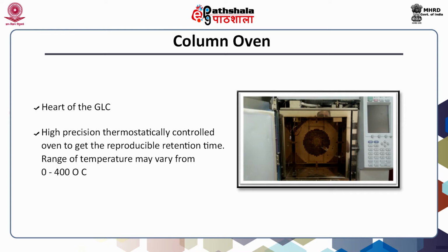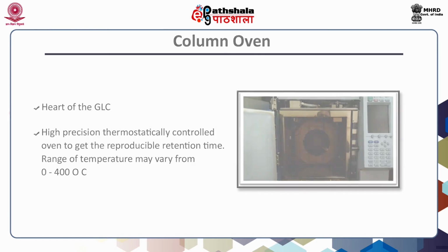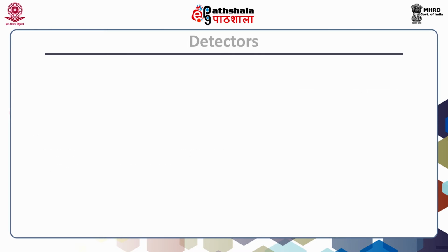That means this oven can maintain a temperature from plus 10 above ambient up to 400 degrees Celsius. It is one of the very important components. Next, we will discuss the detectors.